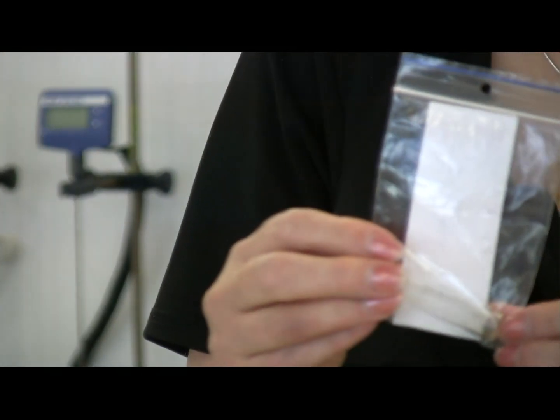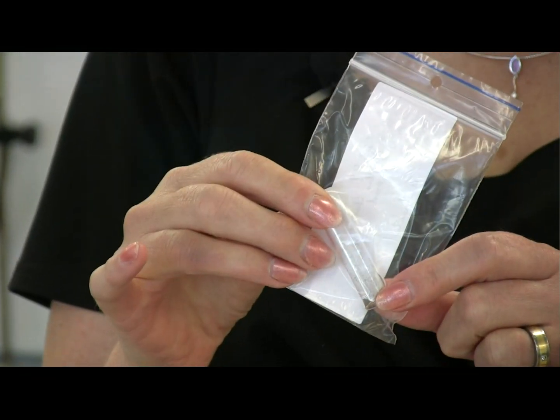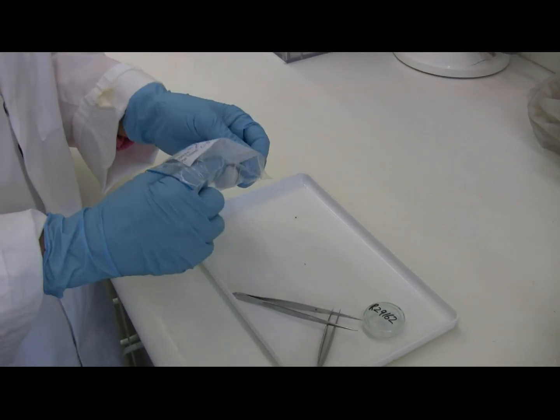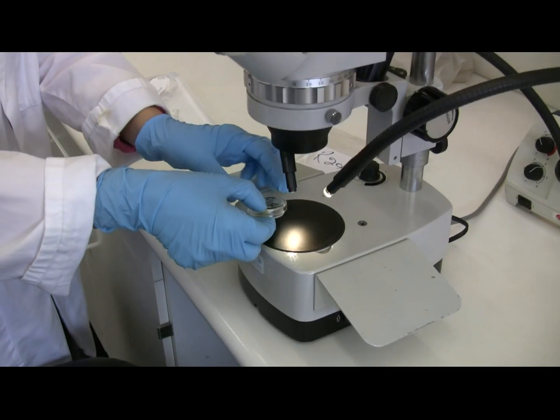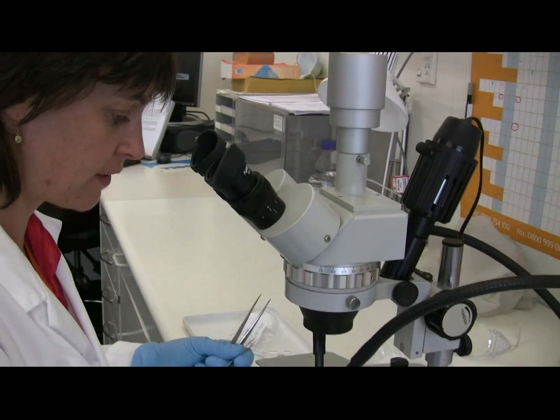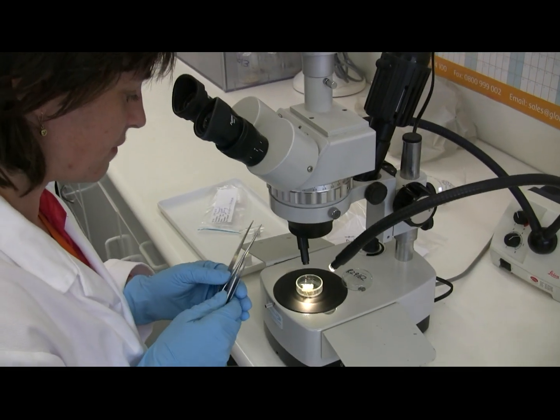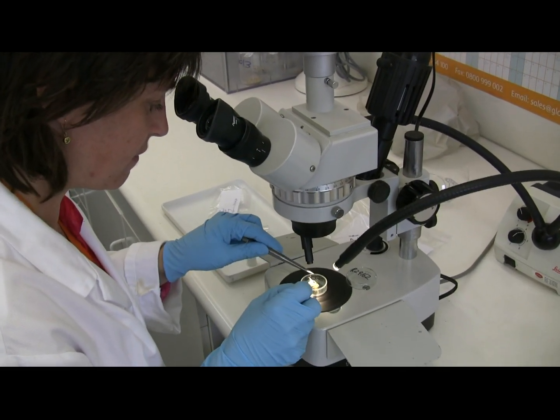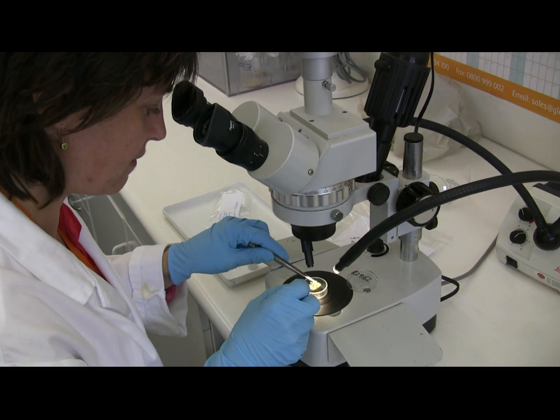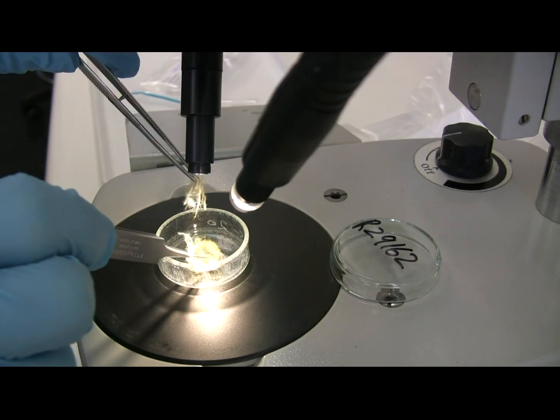A typical example of the type of thing we date in our laboratory is this textile. The client sent it to us hoping that it is 1,500 years old or possibly older, but what he really wants to do is make sure that it's not a modern fake. We look at it first under the microscope, and what we're looking for is identification to see if the sample is what it's supposed to be. We also look under the microscope in order to look for any contaminants that have been added to the outside of the sample that we want to remove.